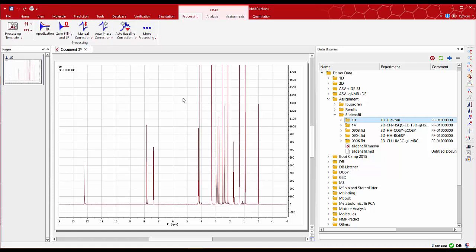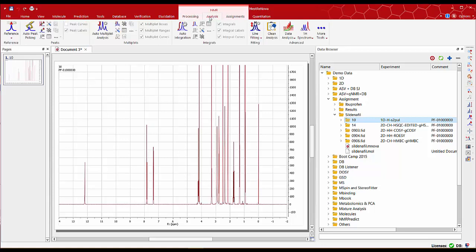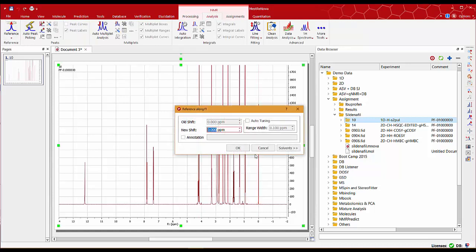This spectrum is now ready for analysis so go now to NMR analysis and select reference to make sure that this peak is set to zero.